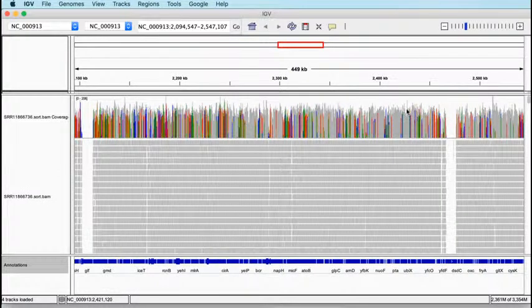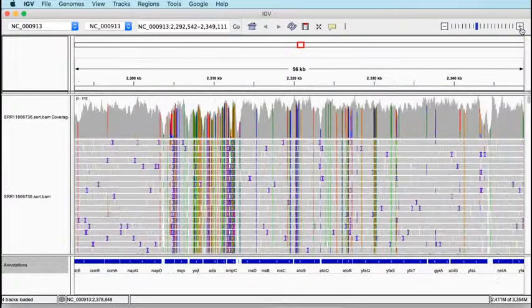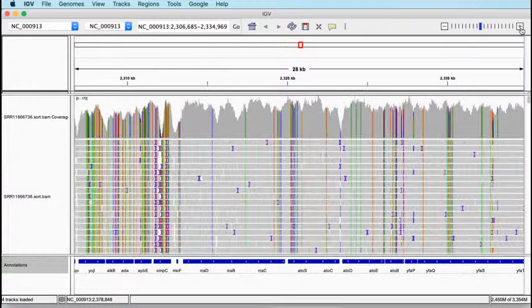So I'm still sort of 500,000. There's still 500,000 bases in my view here, and it's visualizing the alignments. I suspect that's because I've got IGV set up so that it visualizes the alignments from quite a long way out. I think by default you'd probably have to get quite a lot closer in than this to be able to see any data. So that's not especially useful still. So I'm going to zoom in until it looks a little bit more useful.